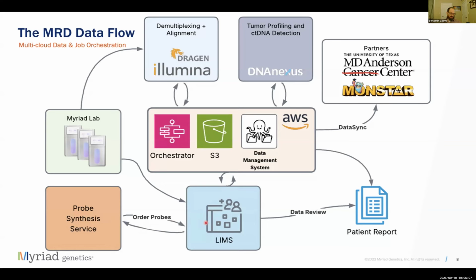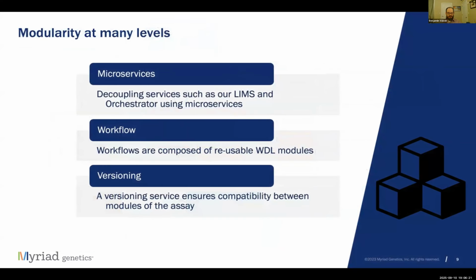And then when detection is run, this process is very similar. However, one of the inputs now is going to be the probes for targeted alignment. How can we accomplish this?